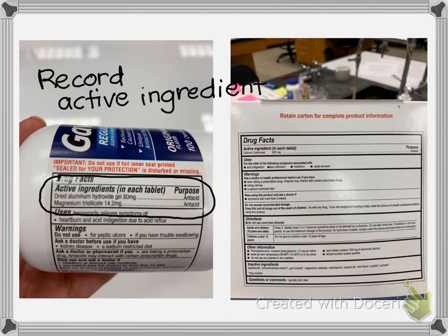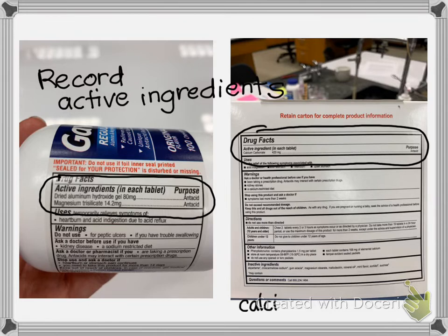If we would have been in lab, I had 4 different antacids, but I only did 2. If this is hard to see, it's calcium carbonate. And again, it's per tablet. And it was 420 milligrams. I think the other one you can see.